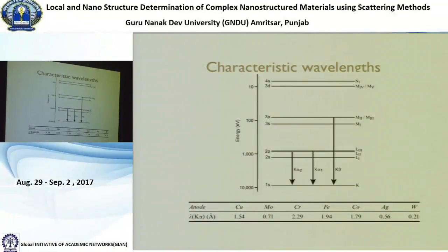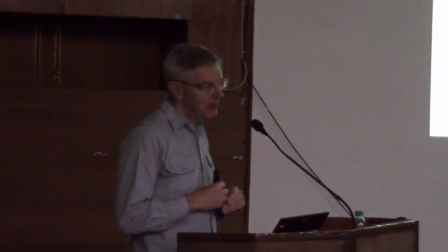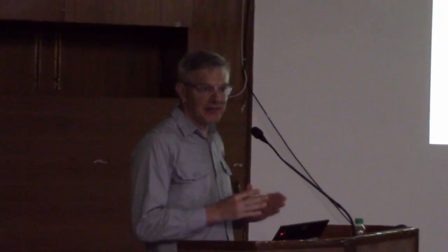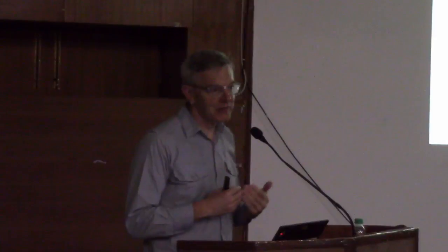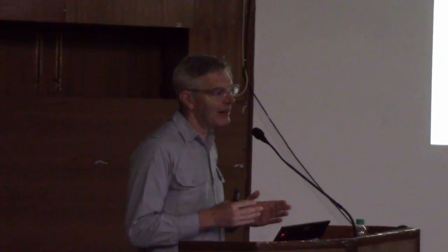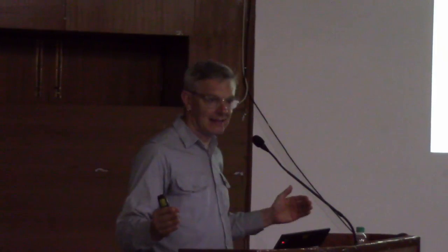So this is the important thing. When you do diffraction, you always want to have high resolution so you can differentiate peaks. But you're working in Q space, so you're talking about high Q space resolution. But when we do PDF, we Fourier transform to real space, and we really want to have high resolution in real space. So to have high resolution in real space, you want to have a high Qmax.